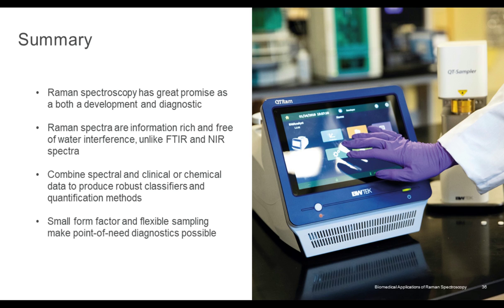And then, of course, we can combine those, and that's what you're seeing in some of the data. And a lot of the research that's going on is this combination of spectral data with clinical data, with chemical understanding of what's happening to produce a robust classifier or quantification method.